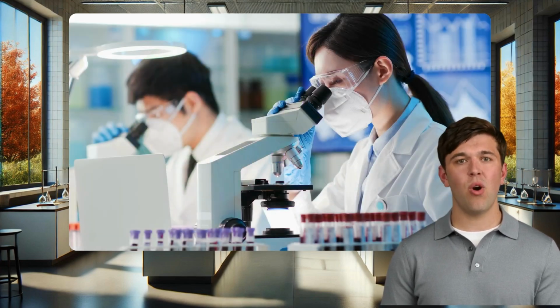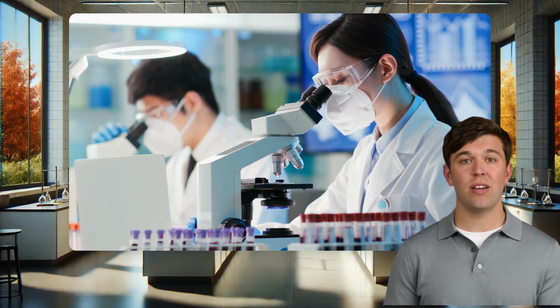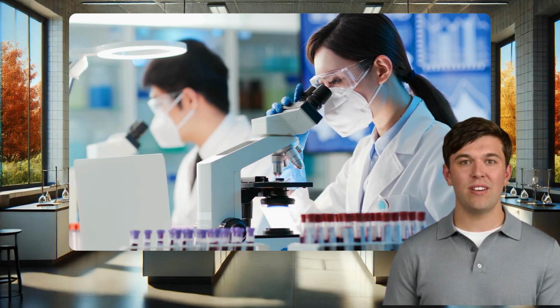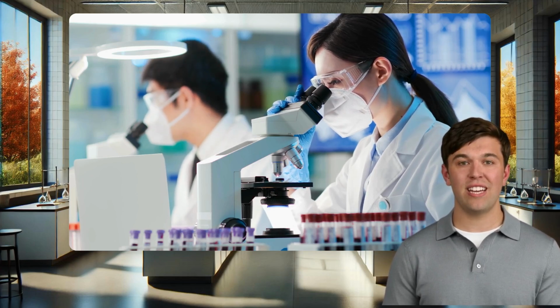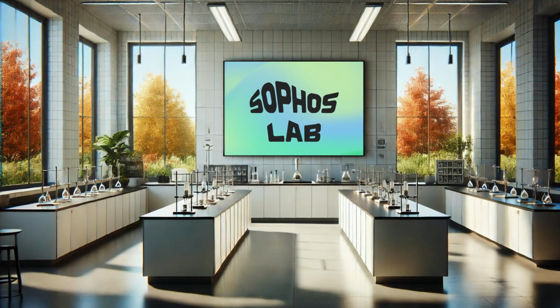We'll be preparing our own microscope slides and using our microscopes to observe sections of plant and animal cells. This practical will not only help you see these cells up close, but also give you the opportunity to practice drawing and labeling cellular structures as we've discussed. Let's get started. Before we dive into the details of preparing microscope slides and using a microscope to observe, draw, and label sections of plant and animal cells, let's take a moment to consider why this practical is important and how it can benefit you.